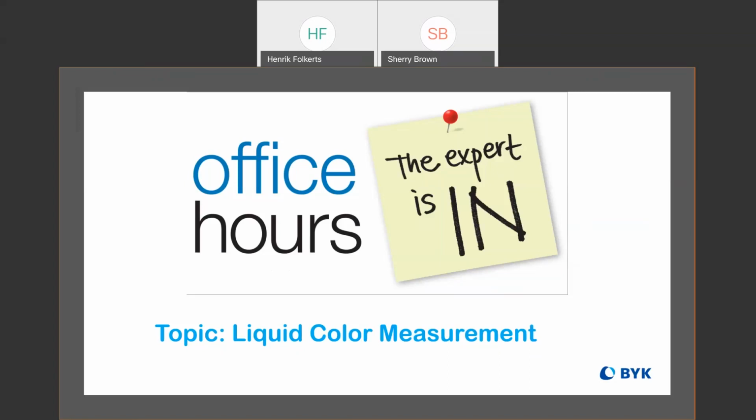Okay, great. Are there specific questions you get a lot, Corey, relating to measuring liquids or transparent type solutions? So I think one of the most common questions that comes up is, will this instrument work for me, and how transparent does the material need to be in order to be measured with the LCS or the LCM, which are essentially transmission spectrophotometers for liquids, and so the light has to be able to pass through the material in order for the instrument to do the evaluation. And if the material is too opaque, if it's reflecting or absorbing too much of the light, not allowing enough of it to pass through, the instrument is incapable of doing an evaluation if there's not enough light to evaluate.